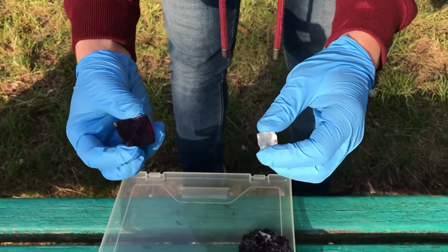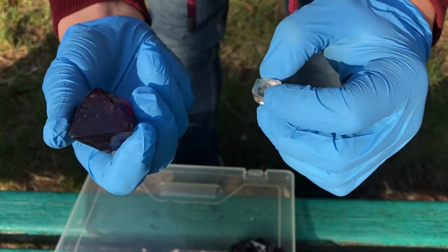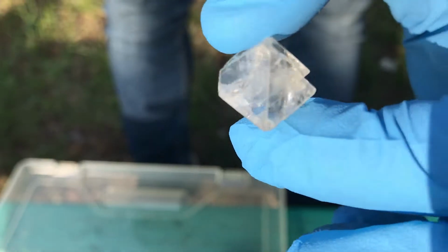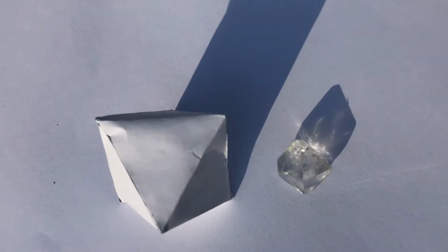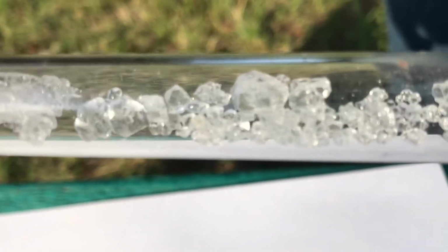The bonus one should be the crystal from potassium and aluminum alum, without the potassium and chromium alum. I thought it would look nice if I had a transparent octahedron. It, as well as the others, has similarities with the correct shape. However, it has some additional crystals growing on it. In the test tube, I have some small alum crystals.